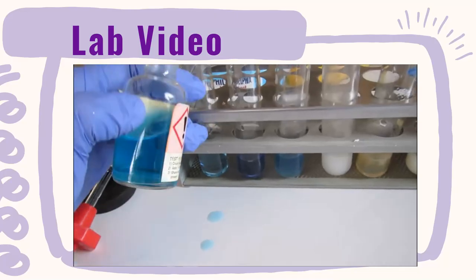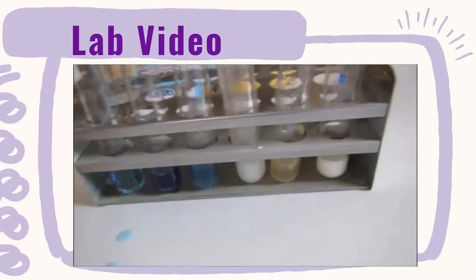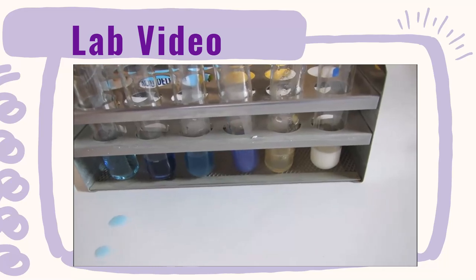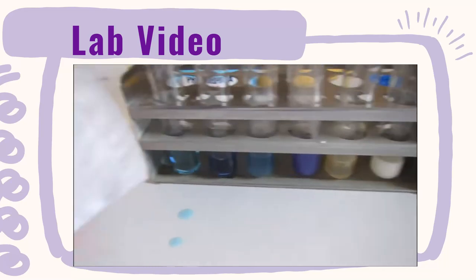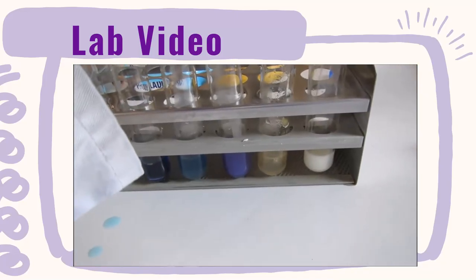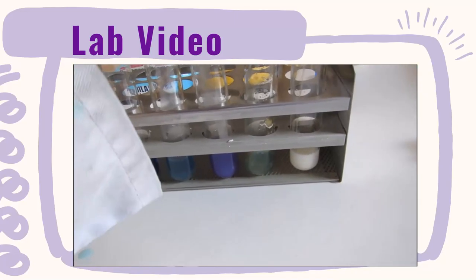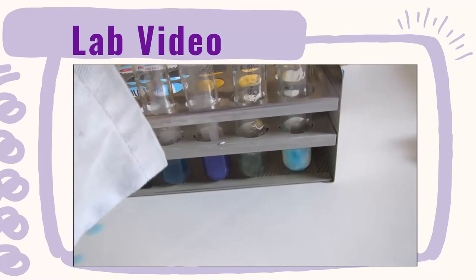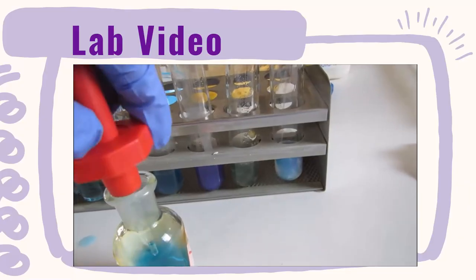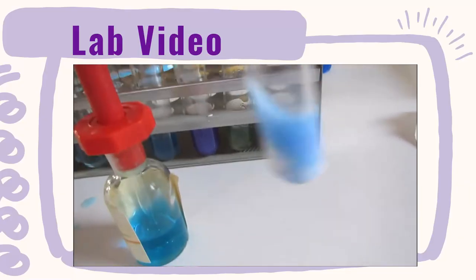So I'll now add it, so firstly to the bread. Do you think this contains protein? Does it look more like our negative control or our positive control? Next one to our cheese spread. Again, does it look more like our negative or our positive control? To the banana, and finally to the milk.